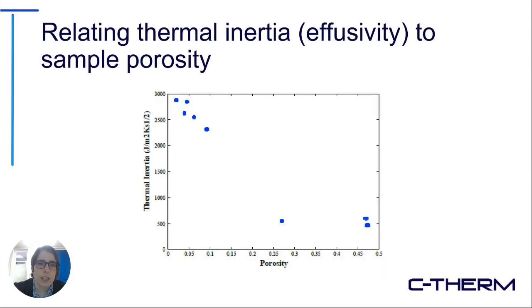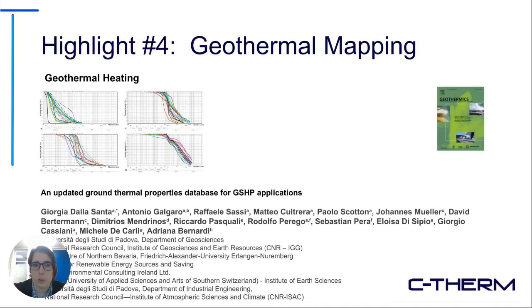And they can characterize here the thermal inertia of the rocks, or their thermal effusivity is another word for that property, relative to the sample porosity. They can also perform a similar exercise with thermal conductivity.